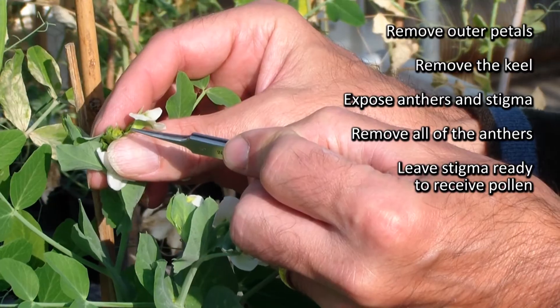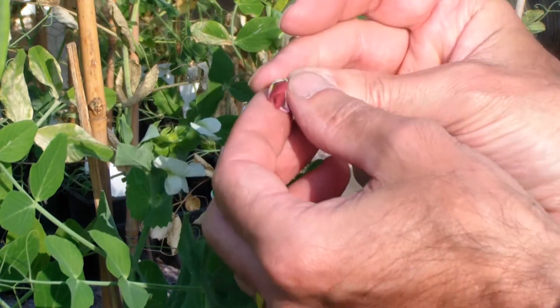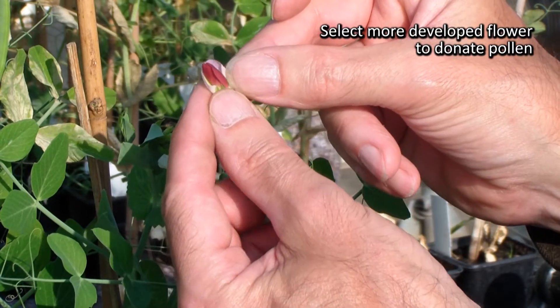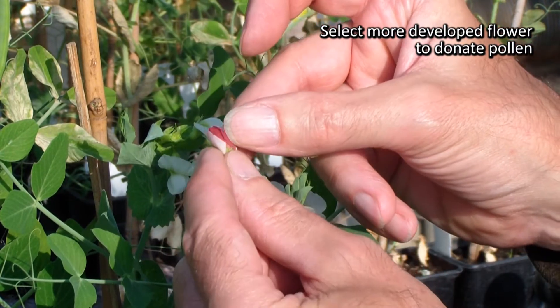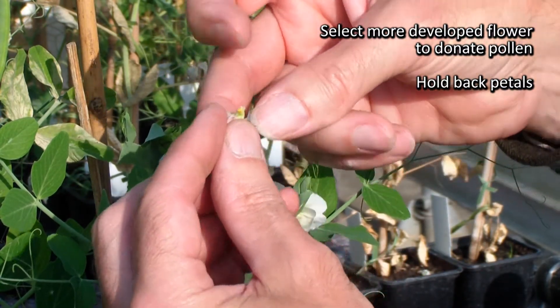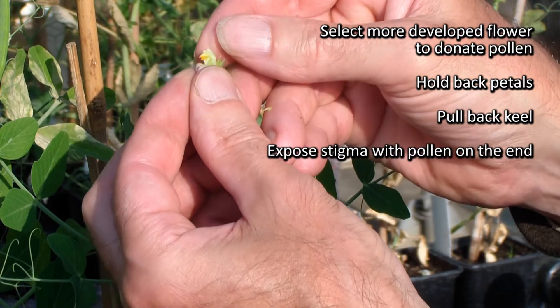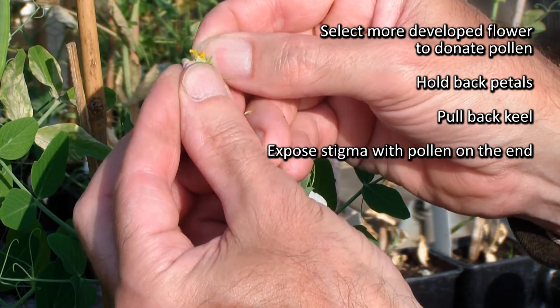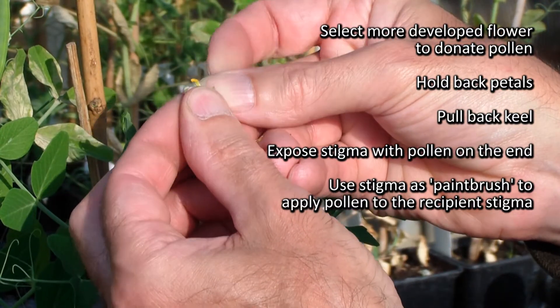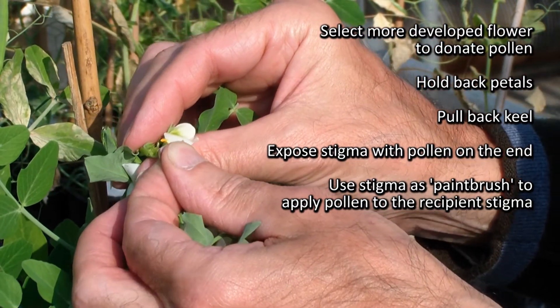There's the style ready to receive the pollen. That style is already ready to receive pollen — you don't have to wait at all. I'm going to come in with a flower from another line, a coloured flower line which is more developed. It will still have viable pollen in it, and I'm going to manually hold back the petals, pull back the keel, and that will reveal the stigma with the pollen on the end.